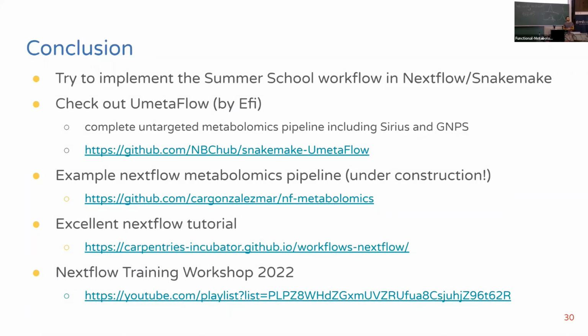But then it's a decision on a lab level, not on the individual level. On the researcher level as well, if you do the analysis. It seems easily customizable, right? Yeah, true, you can change parameters. Exactly. It's pretty much like in MZmine, where we put everything in batch mode, and here you can put different tools in a pipeline. I would say it's just more reproducible. It's way easier to get the same results with one click than if someone forgets one parameter, forgets one step, or does it in the wrong sequence, and it's all different, right?